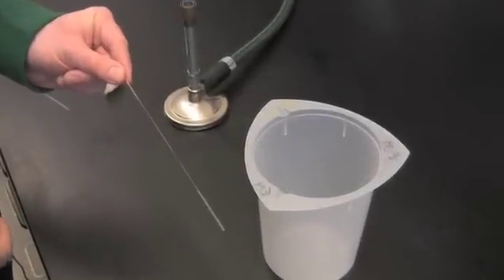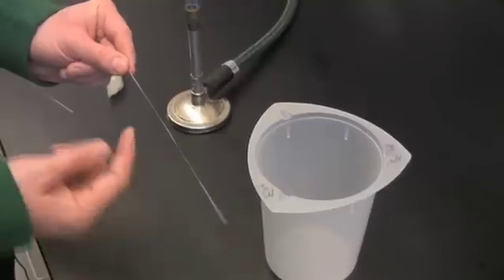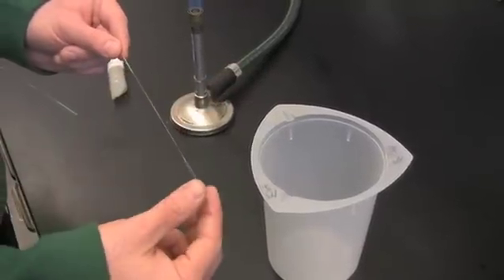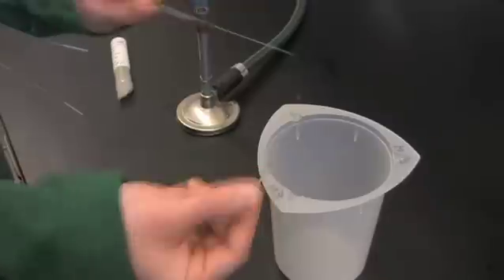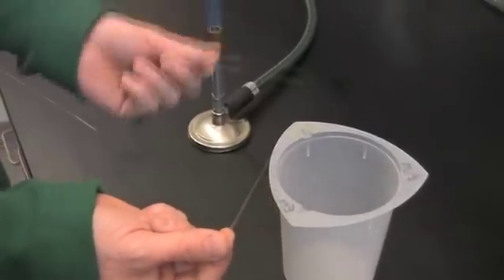So you want to take the tube that you just pulled, and because when you break it this glass could go flying, you want to do it over some kind of container. You want to just snap it, and now you've got two capillary tubes.